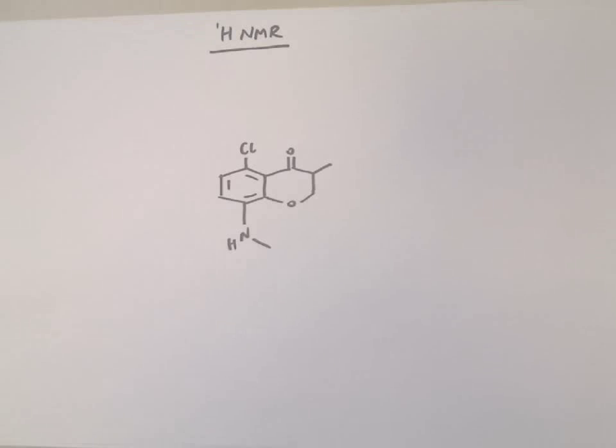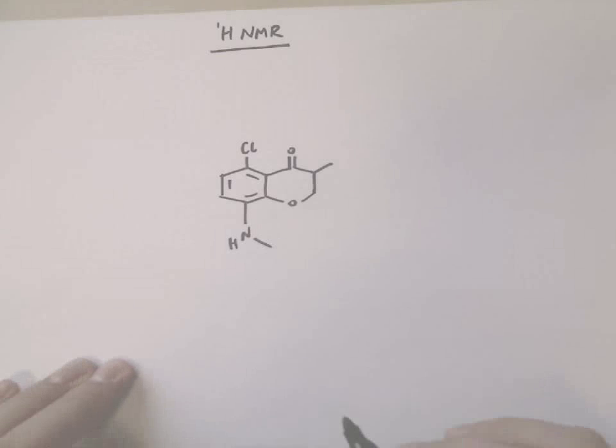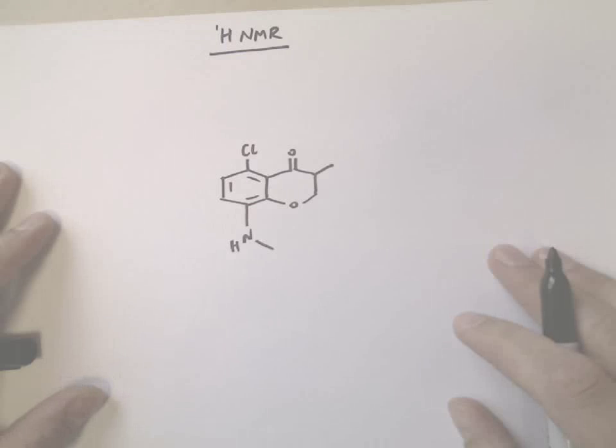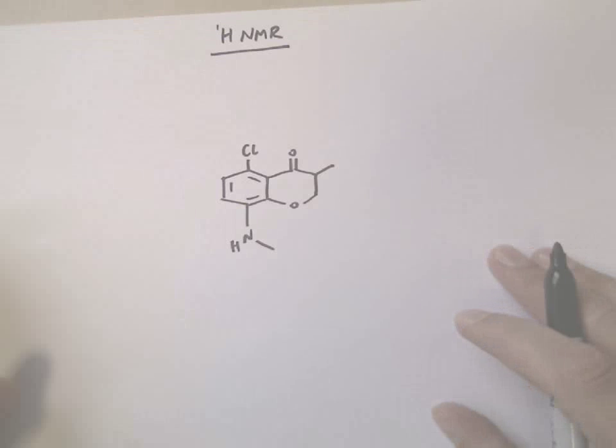Okay, so this is a proton NMR problem, typical of what you might get in the exam. So here we have an organic molecule which could be a drug, and a typical question would ask you to detail the diagnostic signals for the proton NMR of this molecule, or to indicate what an NMR would look like.